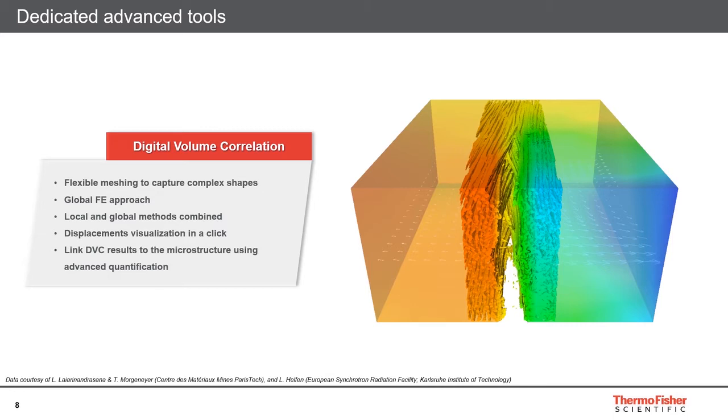The visualization and quantification tools are often limited and not adapted to 4D imaging applications. And most of the time, the results are saved into images where you can have a size of a few gigabytes, and these can add up rapidly during this analysis. Avizo Software DVC extension has been specifically designed for 4D imaging applications. It's a unique solution combining different features.